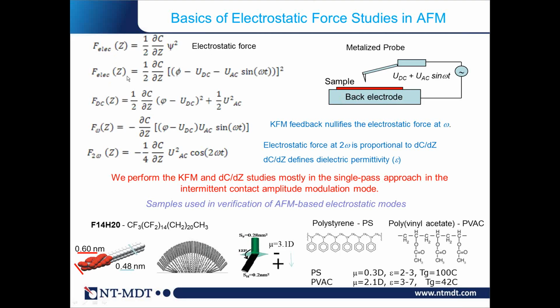Then what we do, we measure electrostatic force, and with additional stimulation of the force at different frequencies and also using the DC offsets, we can learn about the dependence of electrostatic force on the applied voltages at different frequencies and in the DC component. Also, the force will be related to the difference of surface potential between tip and material.